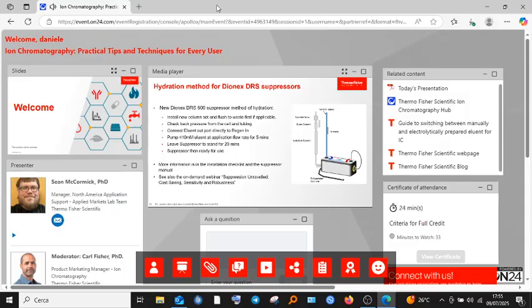There is also a great resource in an on-demand webinar entitled Suppression Unraveled: Cost Savings, Sensitivity, and Robustness. The biggest tip I have for the hydration activity is to make sure that your waste is not plumbed into the flow path of your system. You do not want to flow the liquid that comes out of a suppressor during hydration directly into your conductivity cell or any other detector.